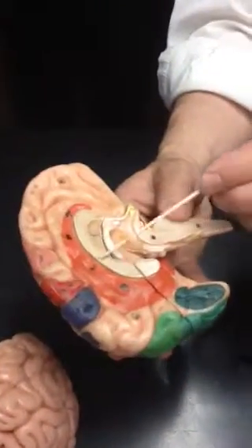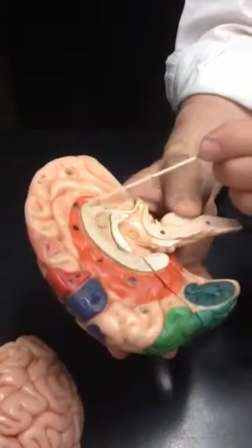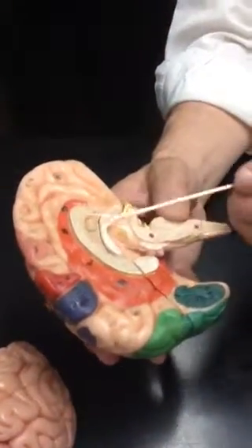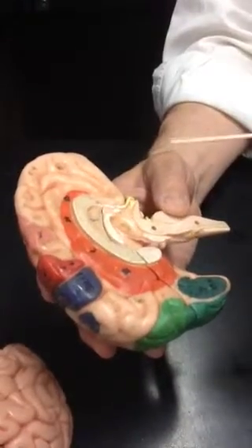If I open this gently, a couple other things around the cerebrum. Connecting the left and the right cerebrum is this large C-shaped structure. This is the corpus callosum. All right, so there's fibers that are going from the left side of the brain to the right side of the brain. Now, inside the brain, we have these cavities called ventricles.